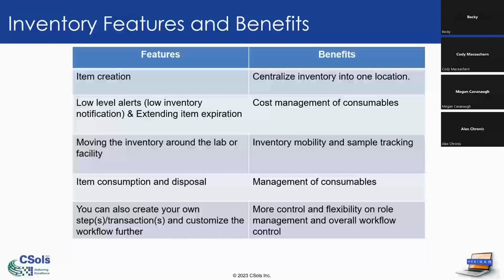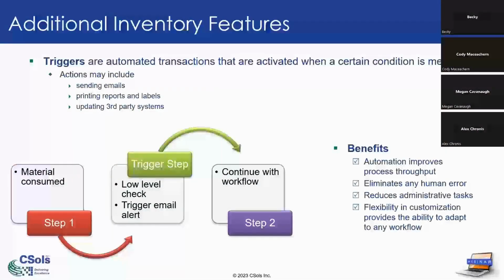There are some other additional features. So something else that the inventory manager has is triggers, which are automated transactions that are activated when a certain condition is met. So some of the actions may include sending emails, printing reports and labels, and updating third-party systems.